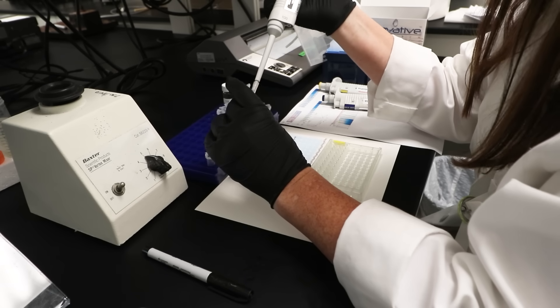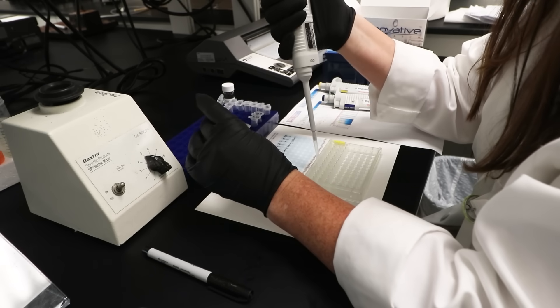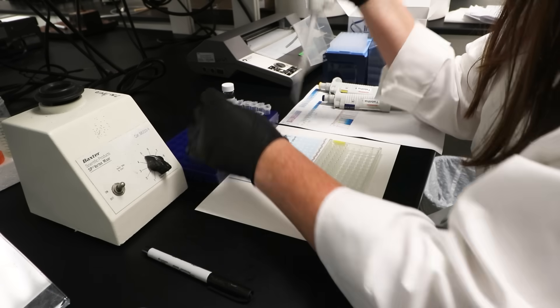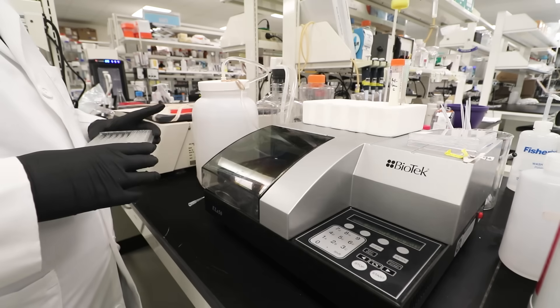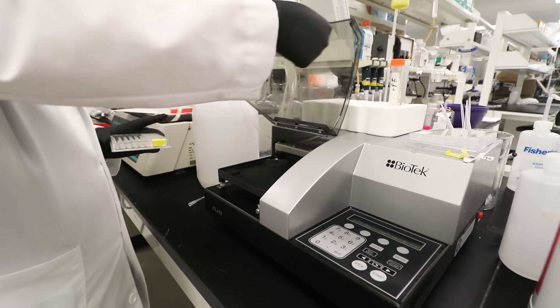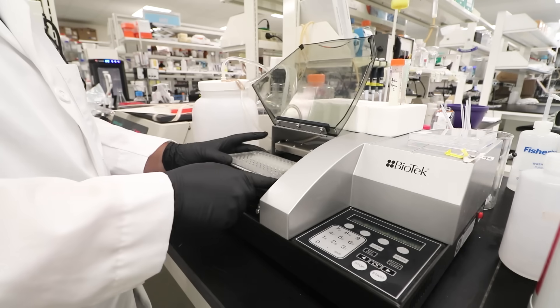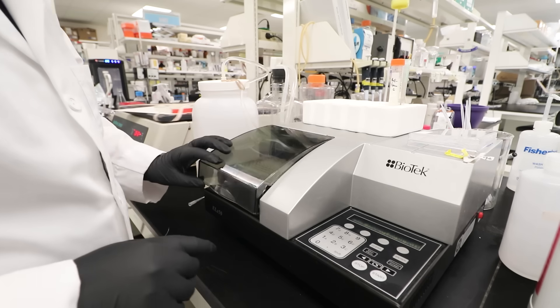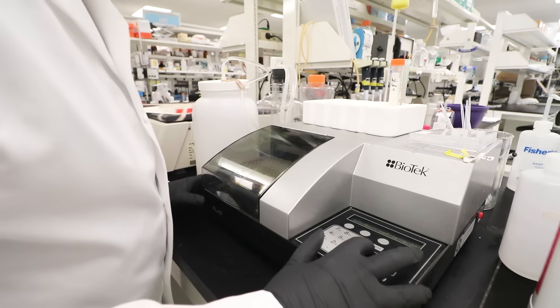Carefully add the standards and unknown samples to the designated wells of the microtiter plate. Make sure that, when performing the assay, you vigorously shake the plate at 300 rpm at each step of the protocol. Ensure that you shake the plate for 30 minutes. Then wash wells three times with 300 microliters of wash buffer. Remove excess wash by gently tapping the plate on a paper towel or kimwipe.